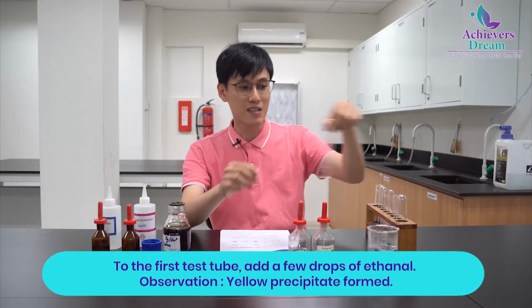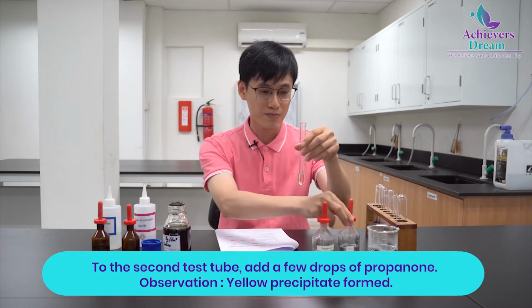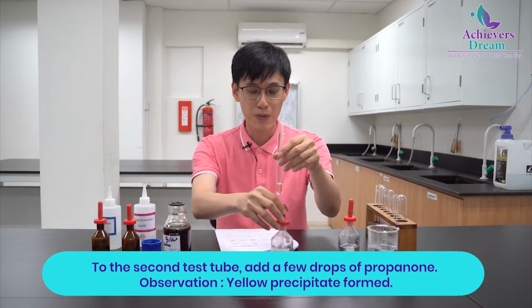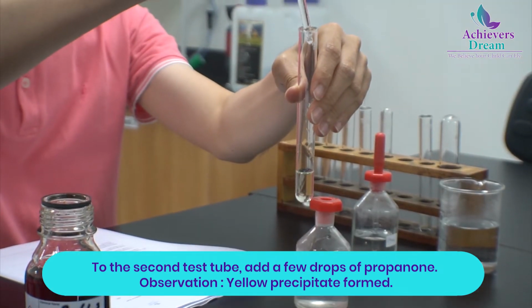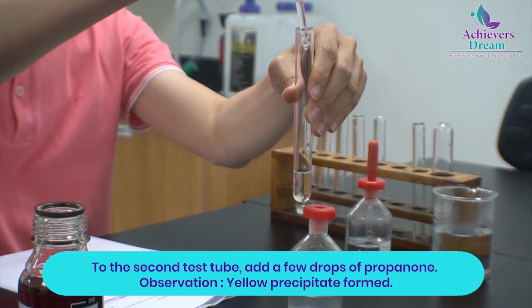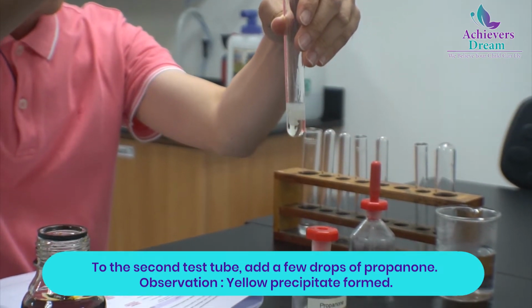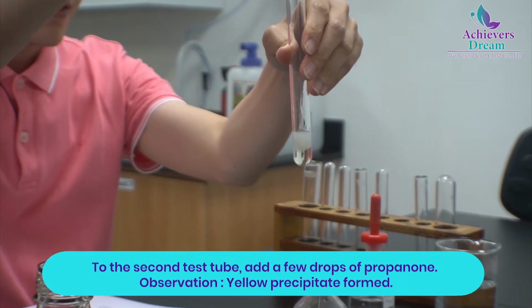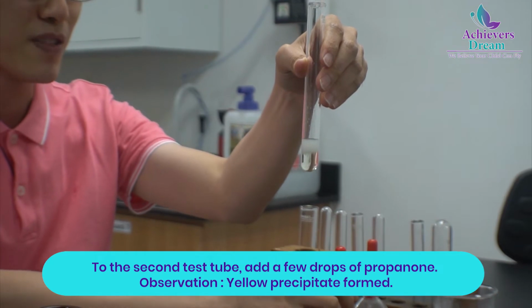I've prepared another solution of alkaline aqueous iodine, which I will now use for propanone. Again, we expect to see a yellow precipitate. Look at the precipitate forming. Yes. Exactly the same observation as ethanal.